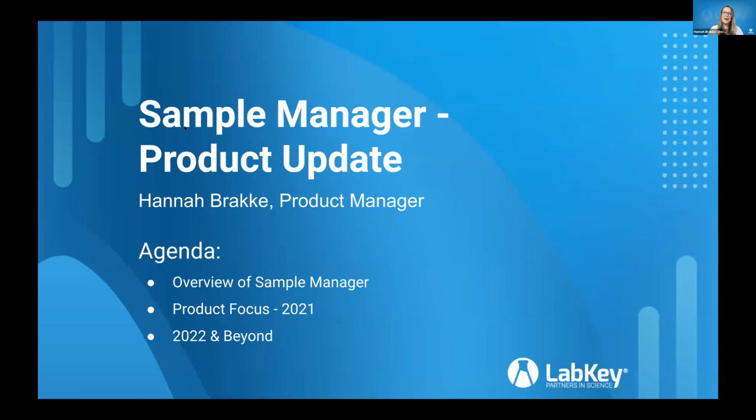I'm Hannah Brakke. I'm the product manager for Sample Manager here at LabKey. I'm going to be giving you a quick overview of what Sample Manager is if you haven't heard about it. Talk about what we've been doing this year. This is our newest product at LabKey, and we've been making lots of progress. And then what we plan to do next year and sort of beyond that as well.